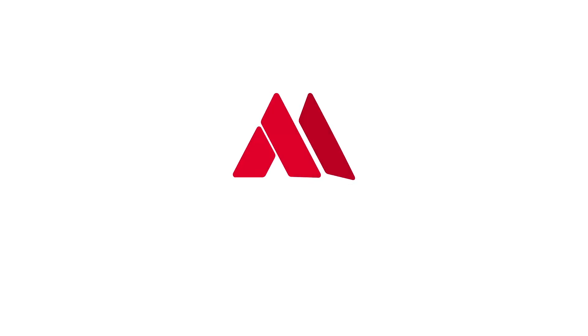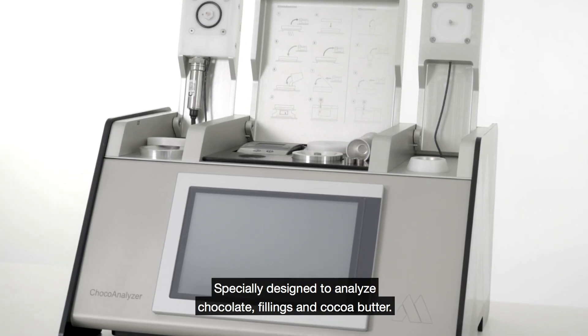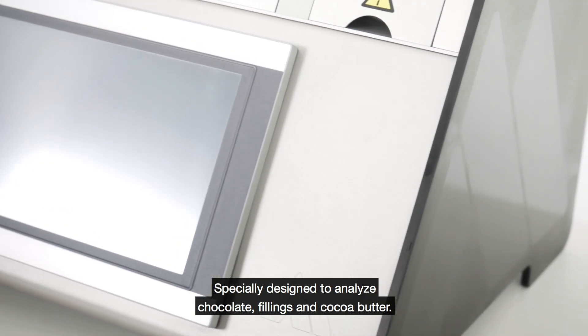The next generation of chocolate crystallization quality measuring: the ChocoAnalyzer. Specially designed to analyze chocolate, fillings, and cocoa butter.